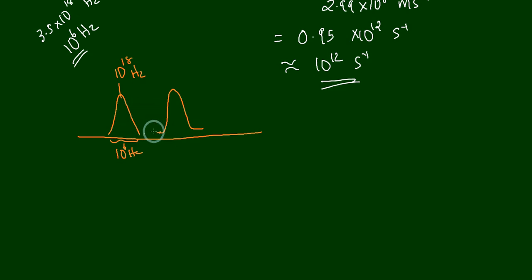So what will happen if the sample nucleus is placed in the way of this gamma radiation? The sample nucleus can absorb any frequency which is under this band, because this is the frequency required for the sample nucleus to be excited to make a transition to its own excited state. But what is the actual frequency felt by the sample nucleus because of the Doppler shift?